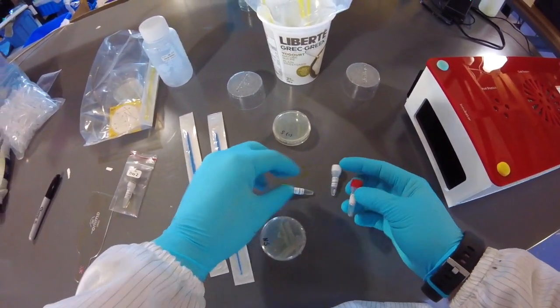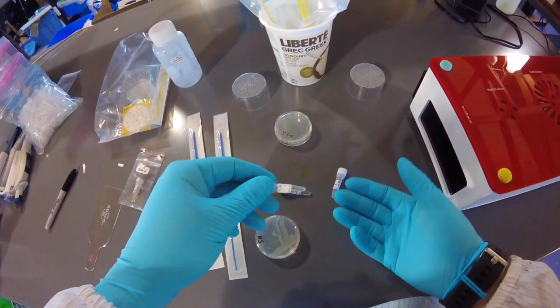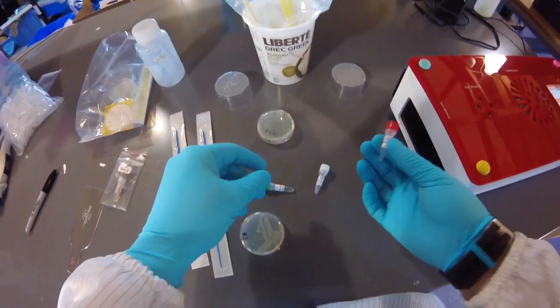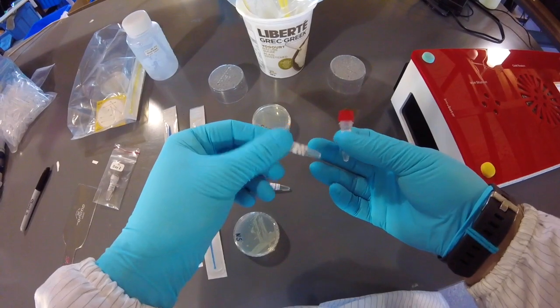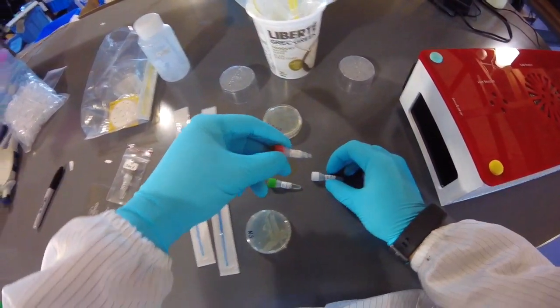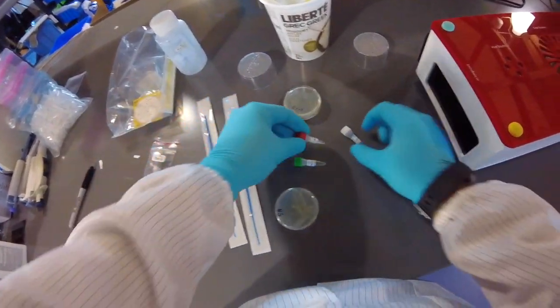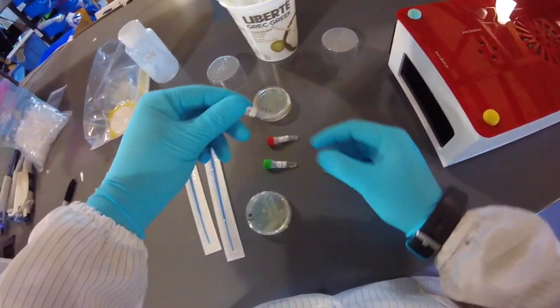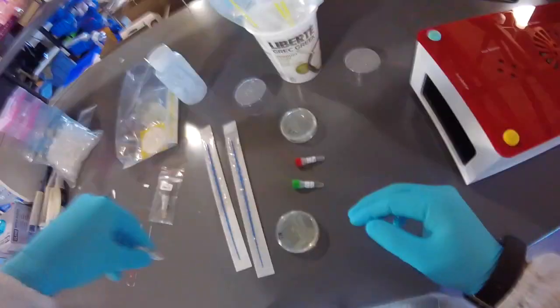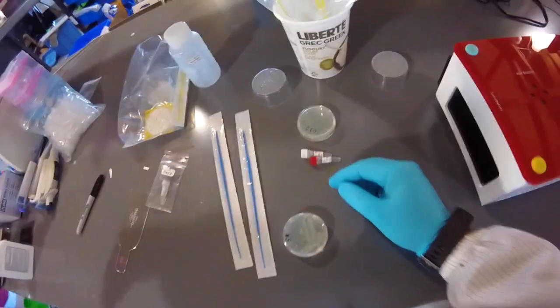Whenever you're starting this experiment, you want to make sure all the liquid or most of the liquid is in the bottom of the tube. You can either do that with your centrifuge by putting the tubes across from one another and doing a really quick centrifuge so that it's all at the bottom. Or you can do a quick snap, so you just kind of do the whip like this, and then the liquid will get pulled to the bottom. You can even tap on the bottom. That'll cause some of the droplets to go down. Okay. Some liquid at the bottom there, recovery as well.